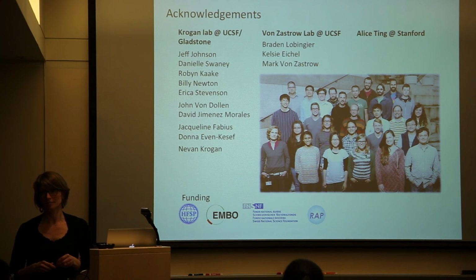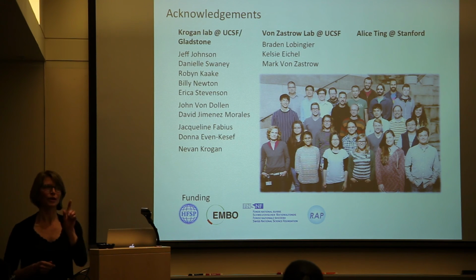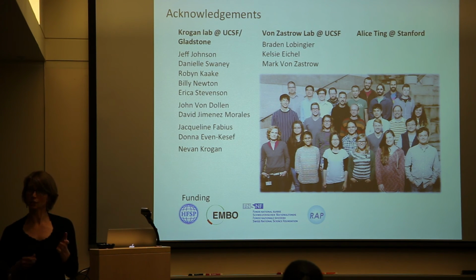So I think what I want to say is that I believe that it works for any localization in the cell, but certainly this needs to be tested. Oh, one thing I know, in the lysosome itself, it doesn't work so well because of the pH.